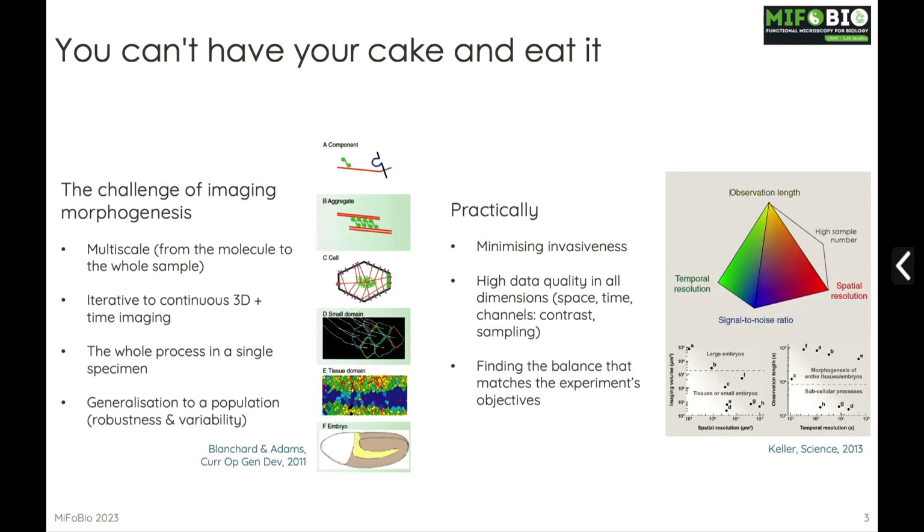Depending on what your initial goal was, you have to navigate through these parameters. Of course, if you want a very short temporal resolution, you may damage your sample, and then damage the state of your objects. So everything is a balance, and you have to navigate through that.